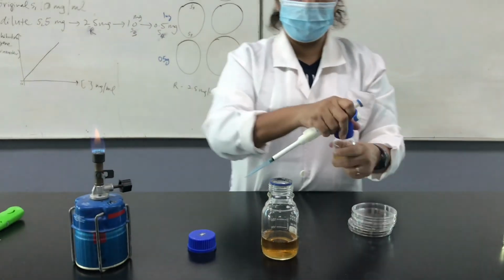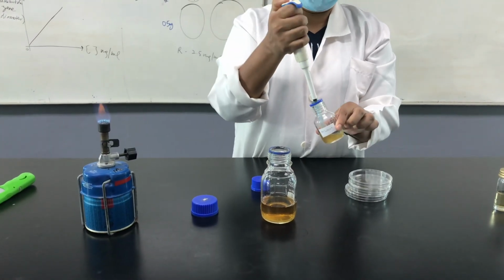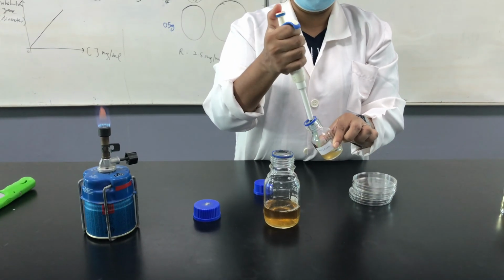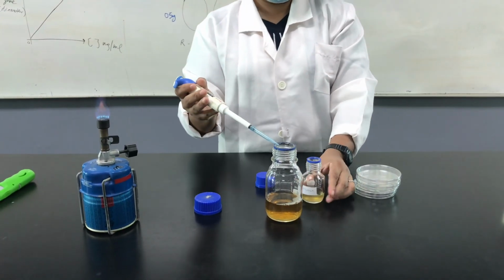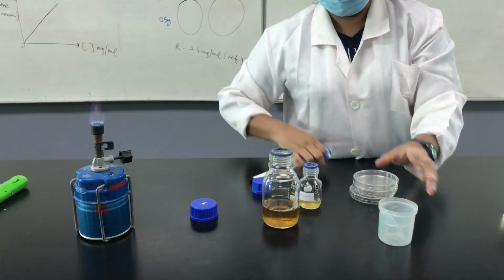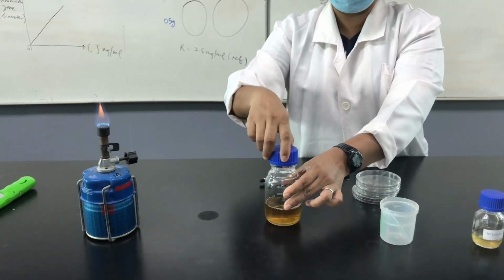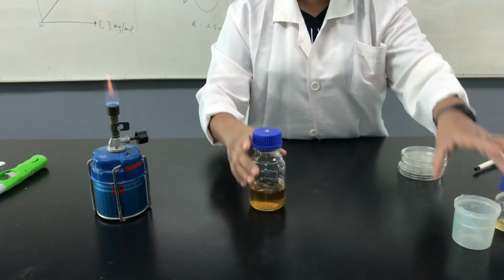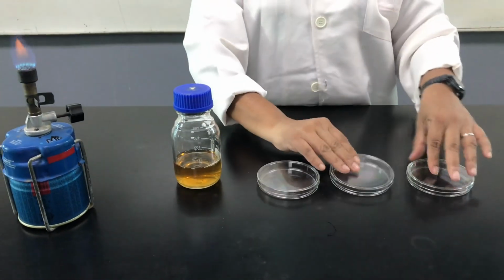We are going to put 2 ml of M. luteus into your agar. It is written in the manual. This is the way you prepare the plate. Once this is done, this is the agar. We give it a slight mix, and then we are ready to pour plate. These are the Petri dishes that you will be using for the pour plate method.